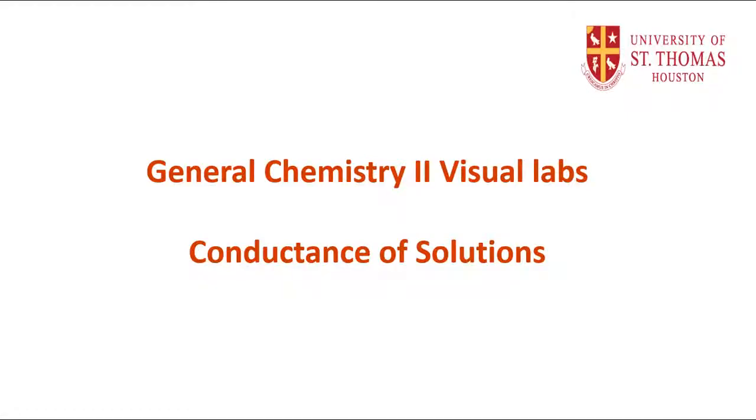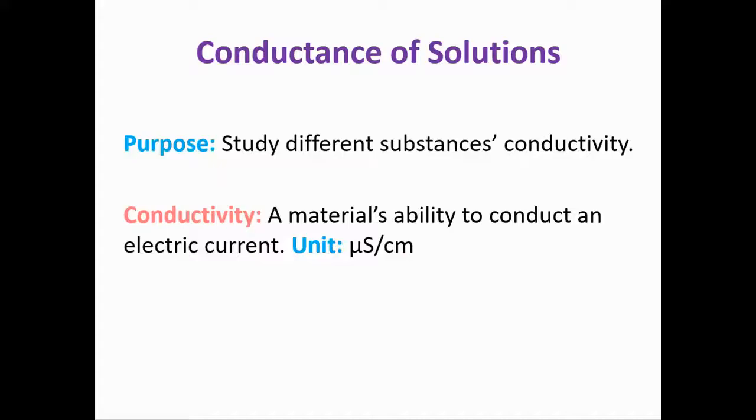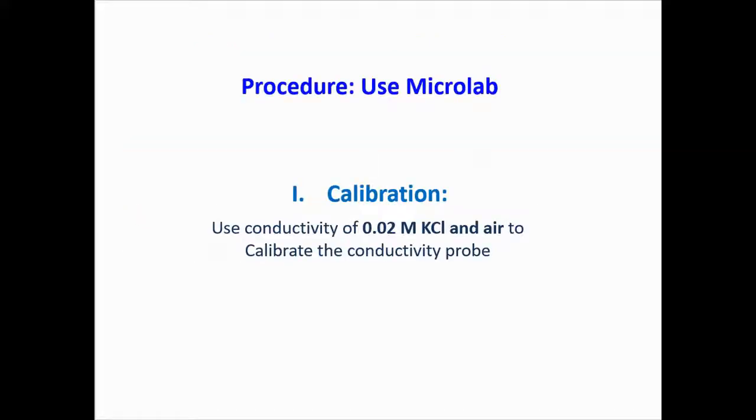Today's experiment is the conductance of solutions. The purpose of today's experiment is to study the conductivity of different substances. Conductivity is a material's ability to conduct an electric current. This current is measured in microsiemens per centimeter. For today's procedure, you will be using a program called MicroLab.